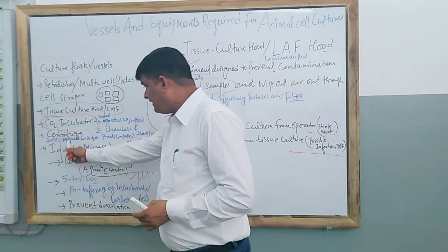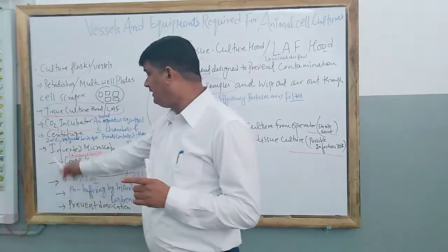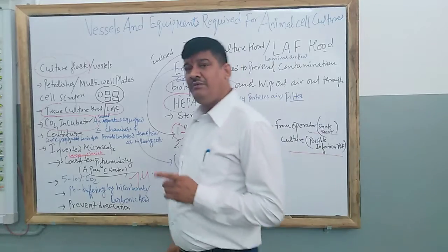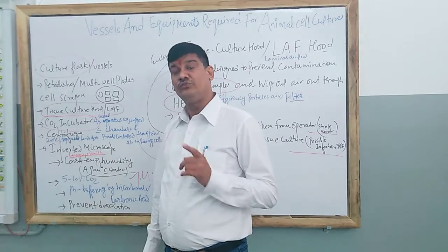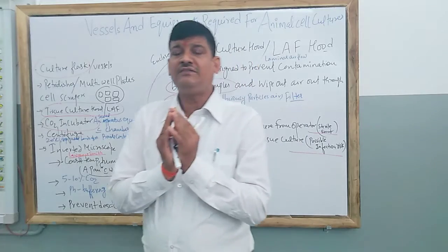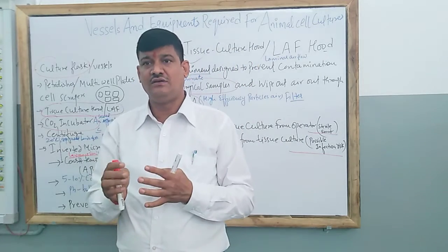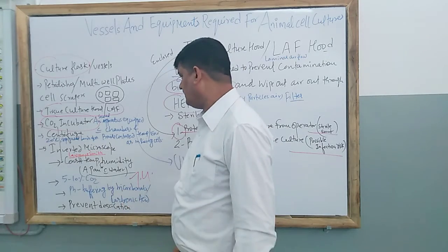So while we are doing the centrifugation, we must keep in mind that a 20 degrees centigrade temperature is required, and it will be at low speed, not at high speed. And the main purpose of centrifugation is that it separates the cells which are found in clusters. So this is the role of centrifugation.